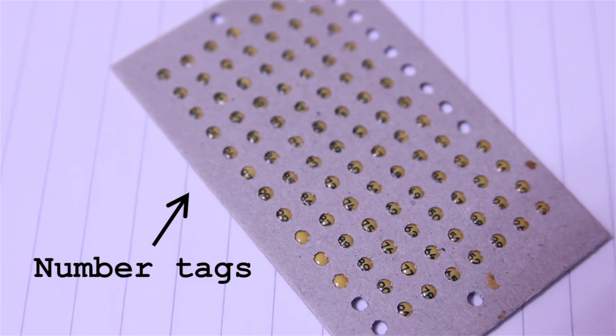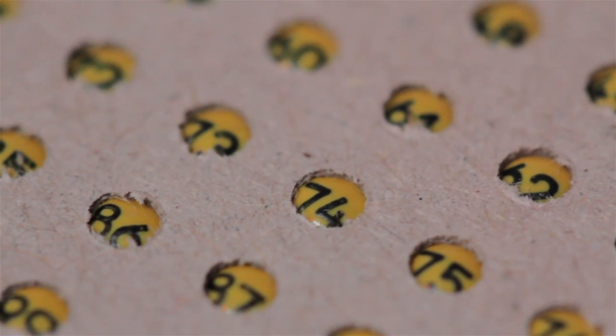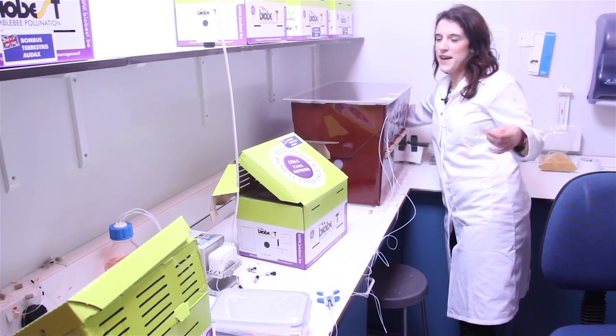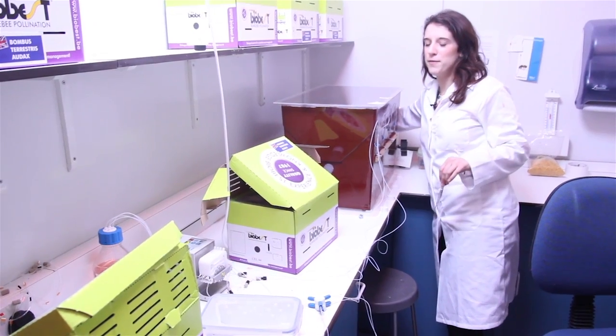We're going to tag the workers so we won't get confused, because it's quite hard to tell them apart. We need to put the red light on first, and the reason for that is, as we said in the last video, we don't want them flying anywhere.